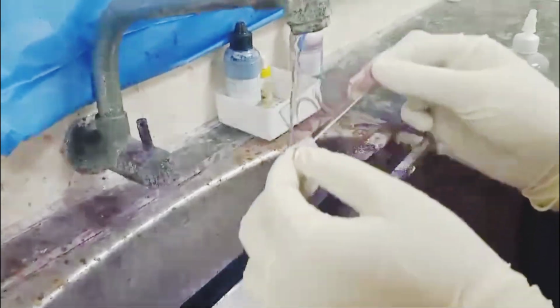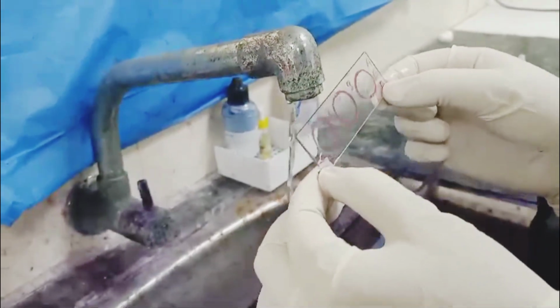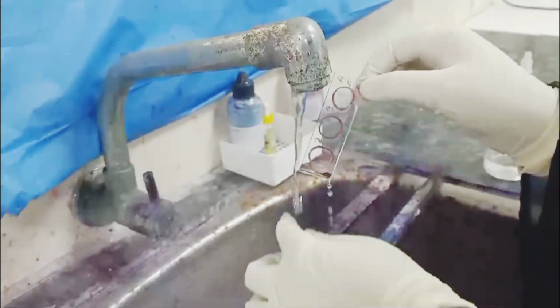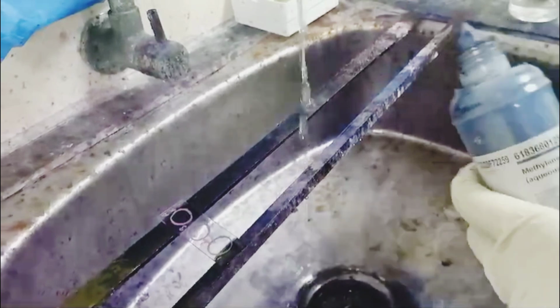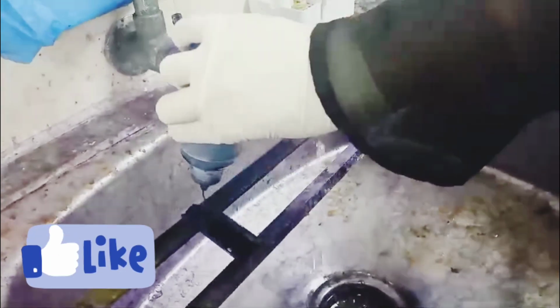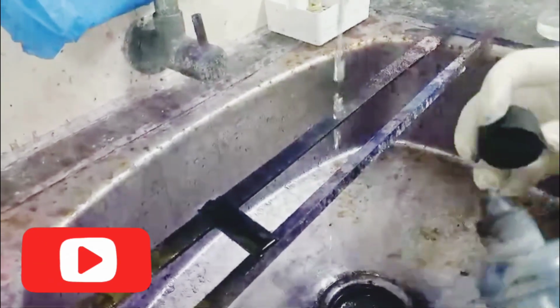Look at the slide wisely, whether the pink color has disappeared completely or not. If the pink color is washed out, pour the secondary stain, methylene blue. Wait for 4 minutes. Now the AFB stain is complete.